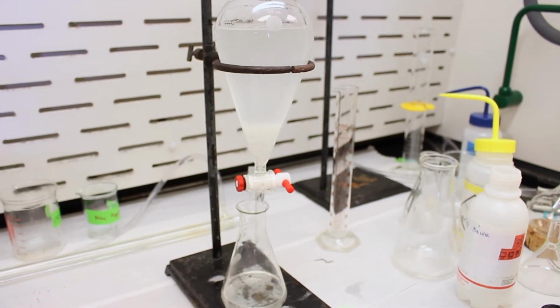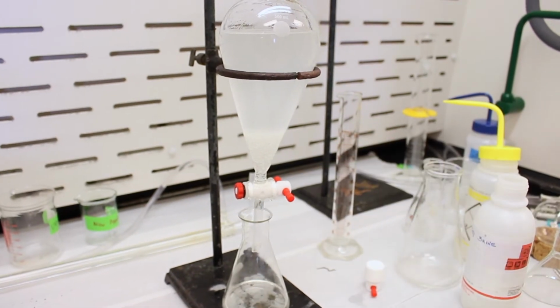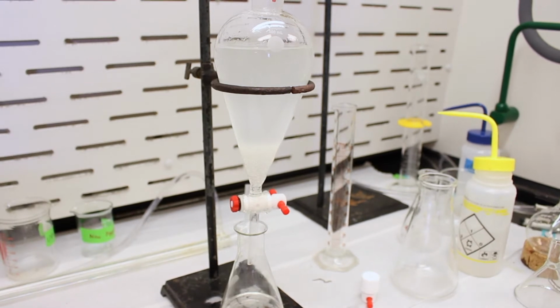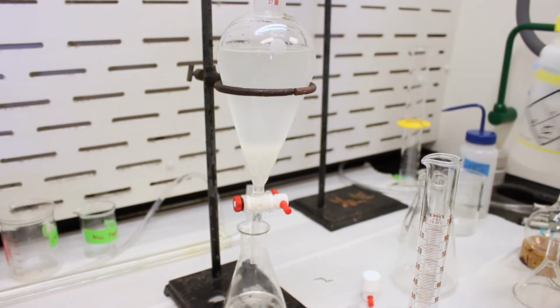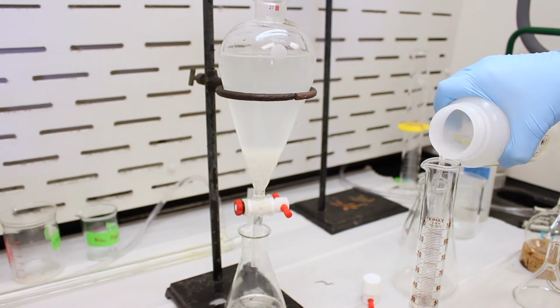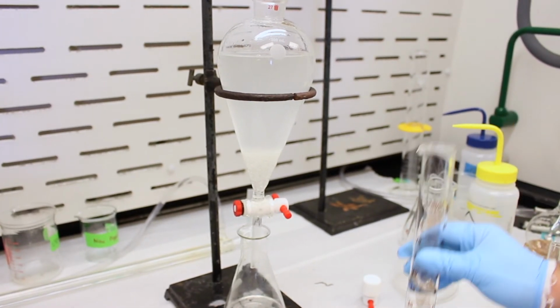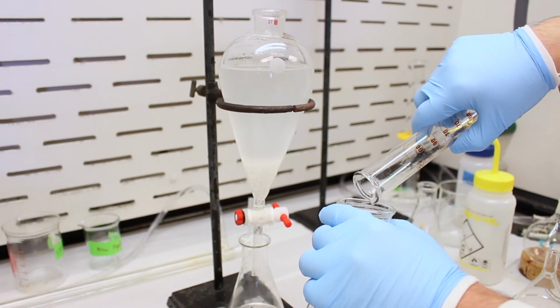So what we can do is just add the rest of the DCM that we're going to add, just like before. So we'll just tolerate that little bit of excess. So add a little bit more. Oh, actually, let's rinse the distillate flask again.